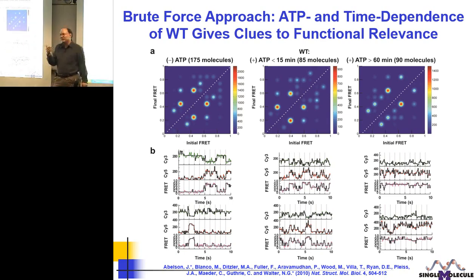So that tells us that the spliceosome works by using thermal motion, a lot of motion between different conformations of the pre-messenger RNA here, that's labeled. It is basically back and forth motion between pairs of states. So thermal motion itself allows for that. But you can also tell from looking at individual traces that this looks very complex.